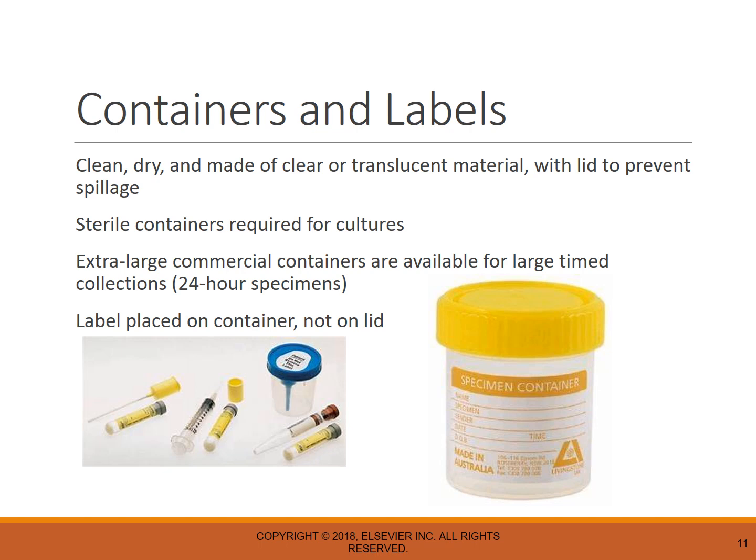Now, when we talk about labeling, all specimen containers must be labeled before or immediately after collection. Because the lids are removed, the patient identification label is always placed directly on the container holding the specimen. Under no circumstances should the label appear only on the removable lid.